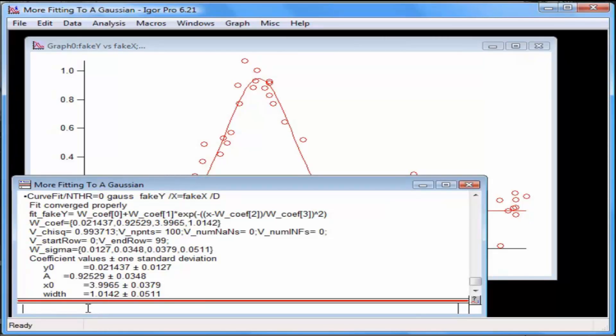As you have seen, the Curve Fitting dialog provides more detailed options for selecting data, models, and output formats. These are useful for fitting data when you have more than one data set to analyze, or when you want to test more than one model on your data.